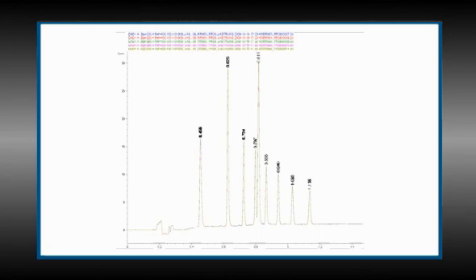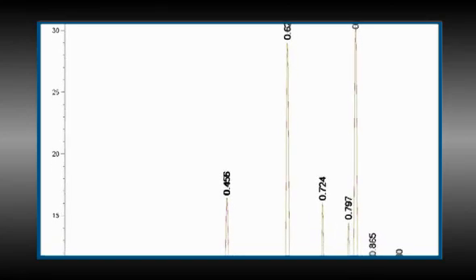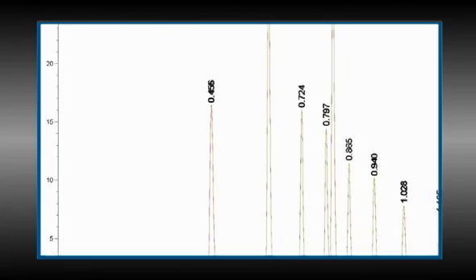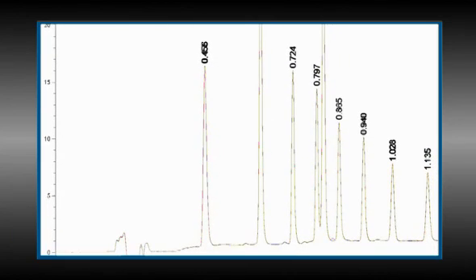Here's what I mean. Look at this chromatogram from a 1290 Infinity LC. It's a great example of perfect chromatography. Here, we have 5 overlays, but they are so identical as to look like one run. Clearly, this is an example of what good looks like. But recently, I began to get this result.